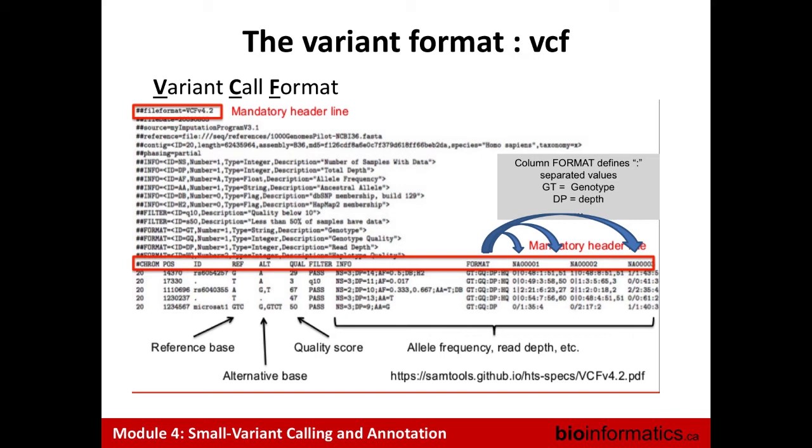For the variant calling, it will be different. You should inform your variant caller that you are in a haploid situation, so it will be only homozygotes. There are no heterozygotes. So for the variant calling, yes, you need either to change your variant caller or to inform it of the number of haplotypes you have in your experiment. Many callers have this parameter, and by default it is 2, but you can set it at 4, 1, 8 depending on your data. But for the alignment, no.